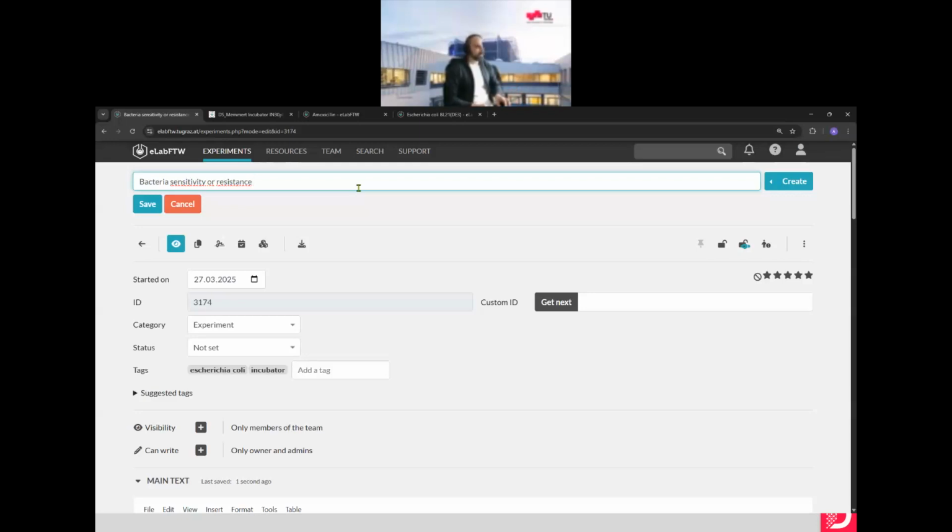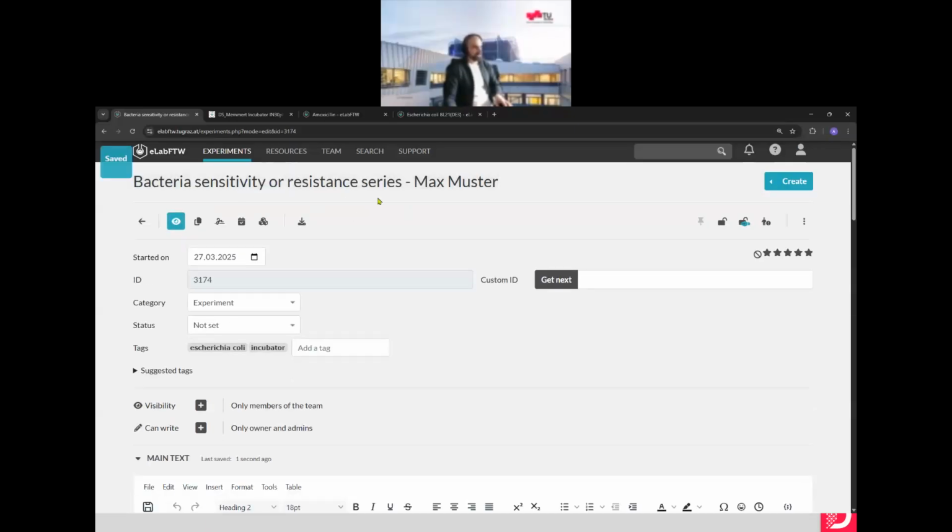So I will add my name here as well, so that I can see from the title which thing has changed. Wouldn't be necessary, but I want to have it easily to see which one is mine.